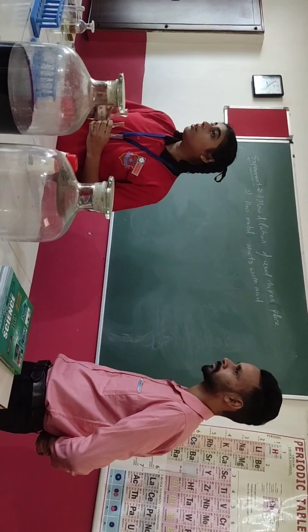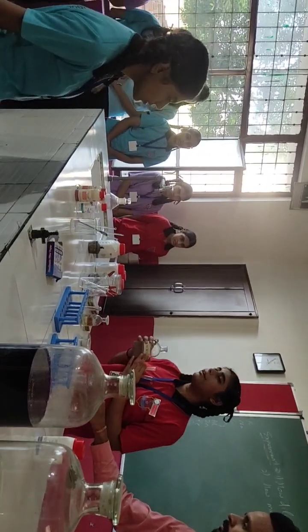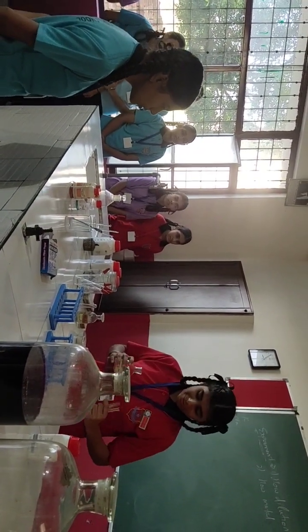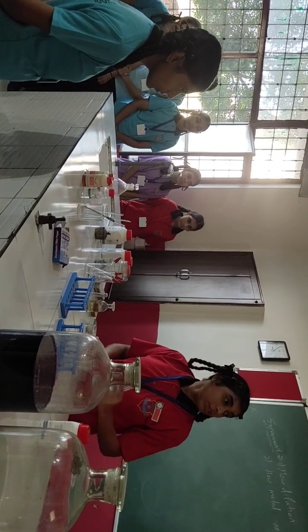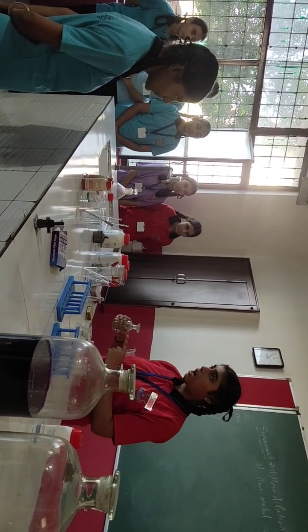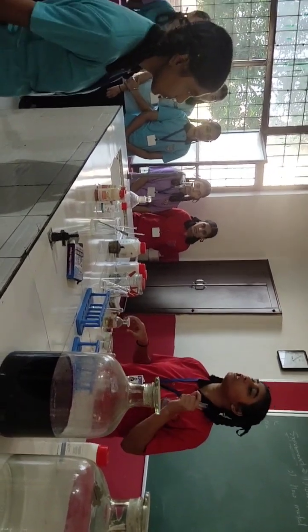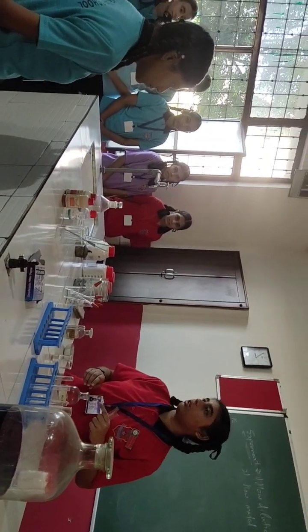You have told that concentrated HCl can harm us. Can dilute also harm us? No, because the reason behind it is that if we make... So allow me to answer the question. I thought that concentrated HCl will harm, but dilute will not harm because we have already decreased the concentration level of the acid by adding water.